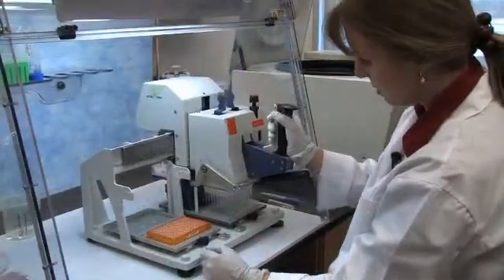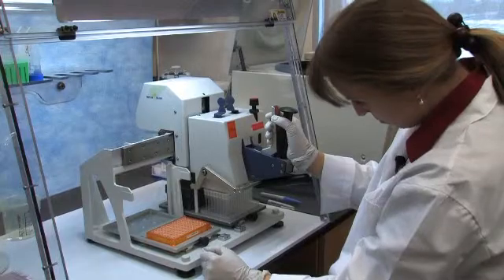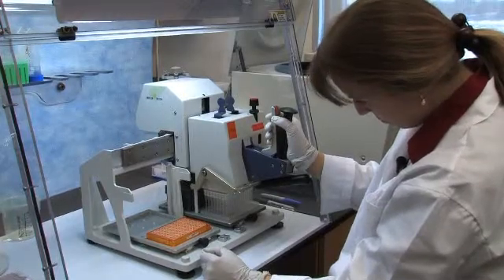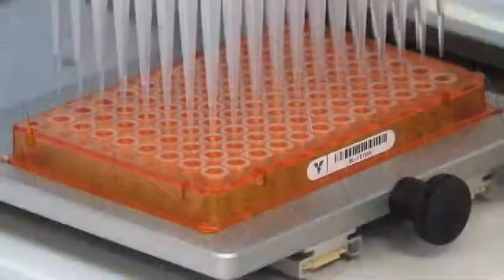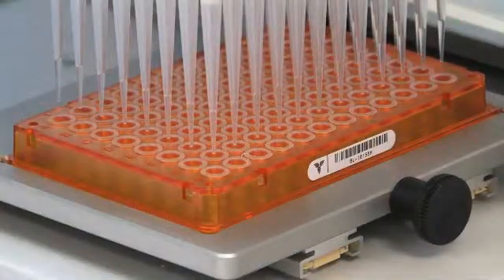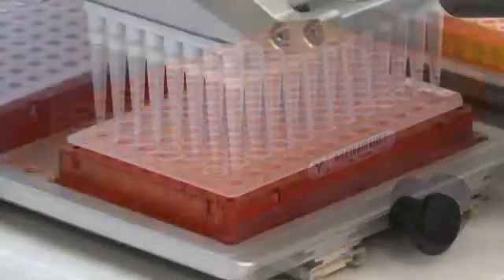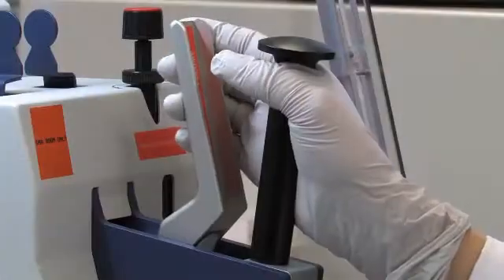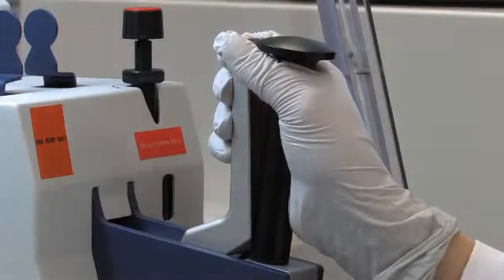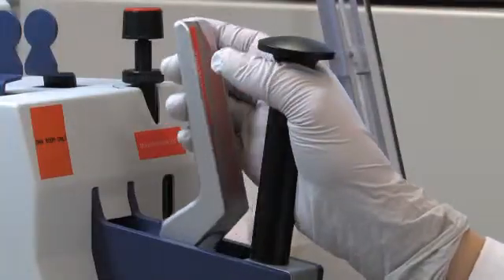Prior to cycle sequencing, the PCR products are diluted three-fold with water using the Liquidator 96. Clean tips are used to add two microliters of diluted PCR product to two pre-made sequencing plates, each containing a different primer. Note how the Liquidator 96 head is lifted slightly, such that blowout can be done directly above the liquid surface. The tips are then touched off and the handle slowly released.